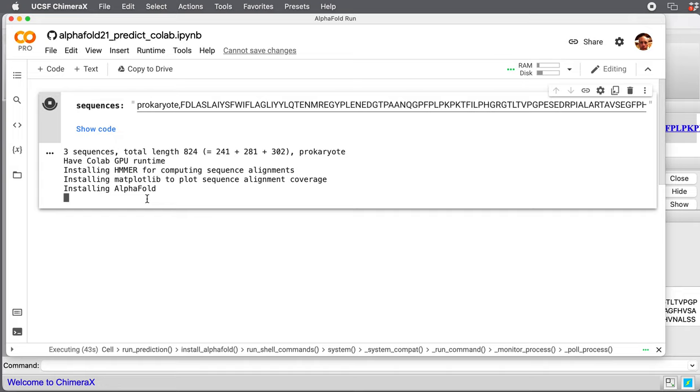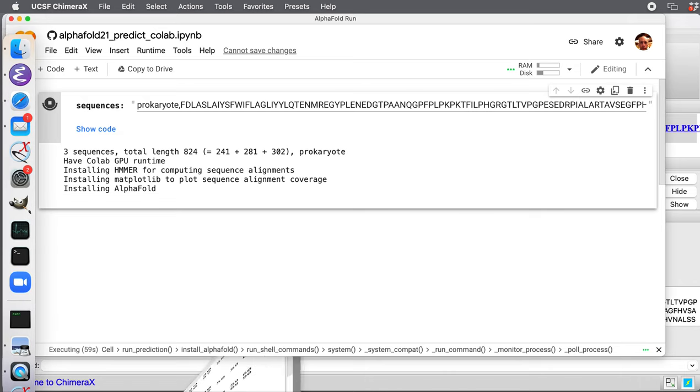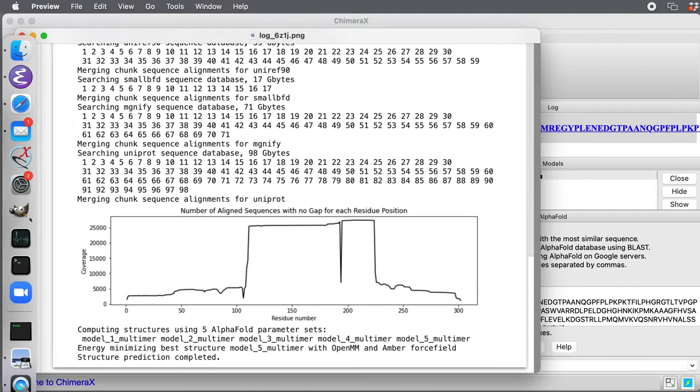Shorter, very small complexes of 100 to 200 amino acids take two hours. All of the runs take a while. So we're not going to wait for that. Let's take a look at what the log output appears. I've run this before. Let me show you what it looks like.